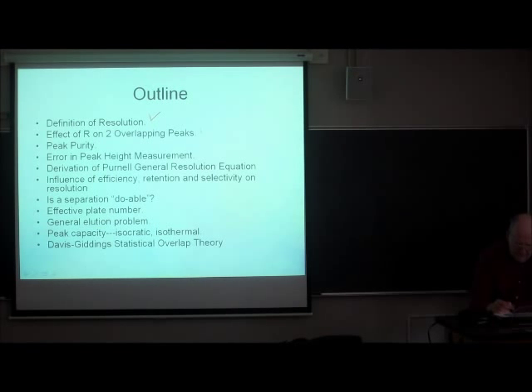So we're going to look at the impact of resolution on two overlapping peaks, peaks of the same height and peaks of different heights. And it's really very important to be able to look at a chromatogram and say, oh, this resolution is good enough. Or, oh, but I got a problem here, and I have to work on getting these two peaks better pulled apart. And we'll be talking about what are the most important factors in getting peaks to pull apart.